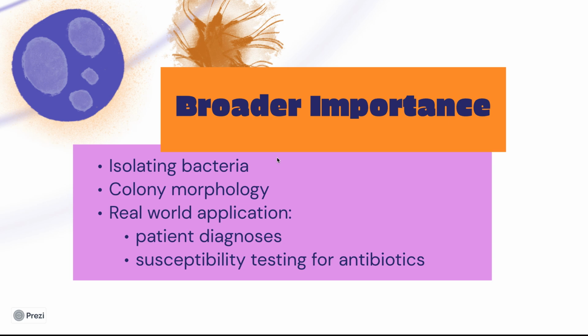And this is very relevant in a lot of different microbiology fields because, as I mentioned, pure samples are rare in nature, and more than likely you're going to get most organisms coexisting with various microbes, including bacteria. So isolating these species enables scientists to distinguish between, say, normal flora and potentially pathogenic bacteria. And this can be crucial in a medical setting because it can allow for accurate antibiotic prescription.